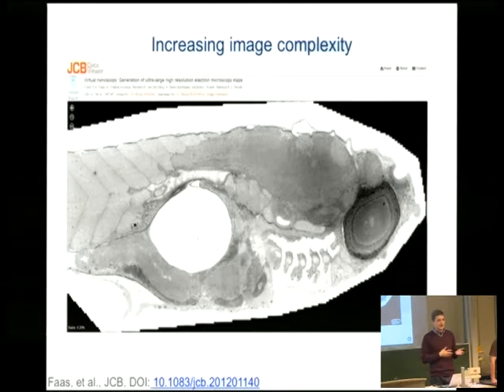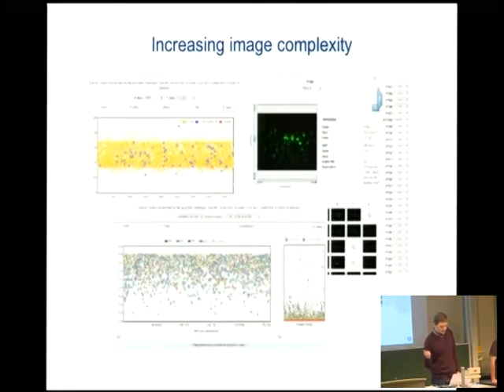There are many other examples like that, like the Stowers data repository. So many academic institutions work on top of our open source project and adjust it to their specific needs. I also mentioned that multiple modalities in images come from the fact that there is also metadata attached to this image. So here's an example of gene phenotyping, which has to go along with the image itself. The image without the specific data being presented this way is just basically half of the value of the whole result.